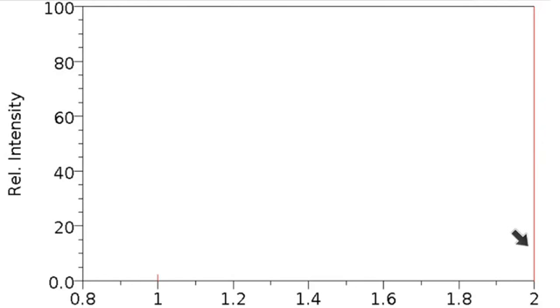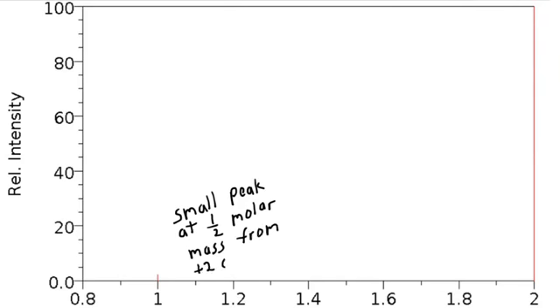Most of the signal is up here, and then you also get a very small peak in these graphs at half the molar mass from particles that get a +2 charge, because it's mass over charge. So a +2 charge will give you half the mass as you expect. And then the rest of it is H2. Hydrogen has a lot more of it that is hydrogen 1 than deuterium or tritium.